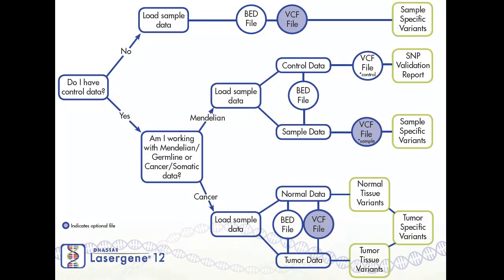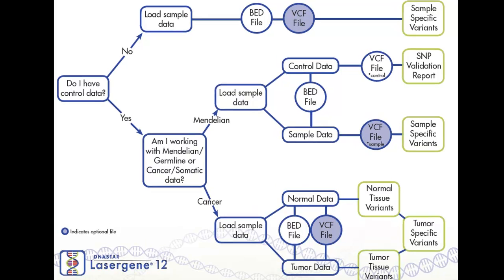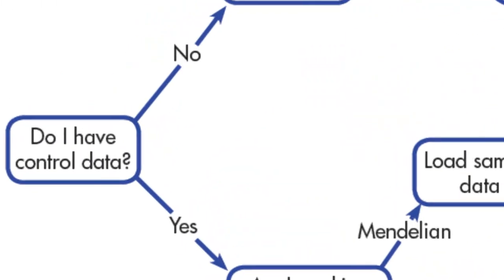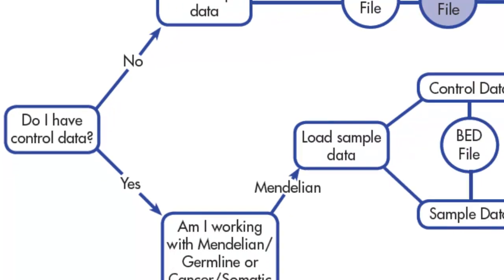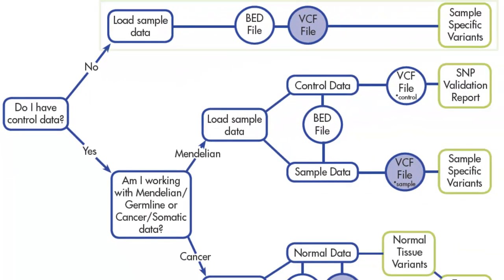When doing GenePanel workflows within our LaserGene Genomics suite, the first step is to evaluate whether you have control data. First, we'll look at the case of a GenePanel dataset without a control.